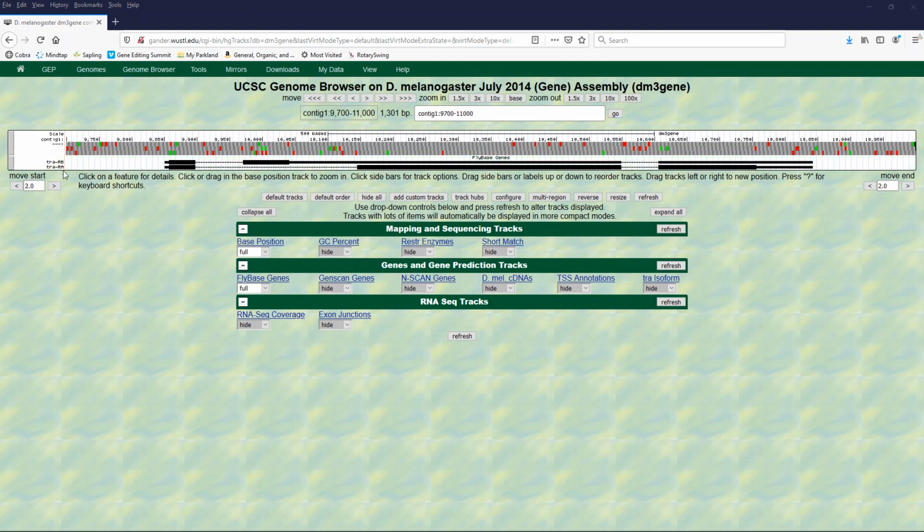Now let's remember up here in the left, we have two different isoforms of this TRA transformer gene. There's transformer RB and transformer RA. Okay, so those two isoforms, and as we're going to see later on, one of these is going to be the female isoform and one's going to be the male isoform.